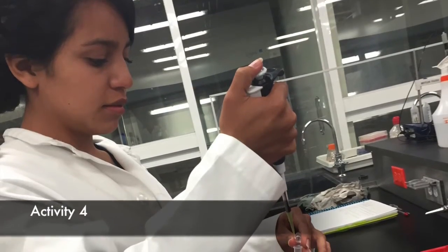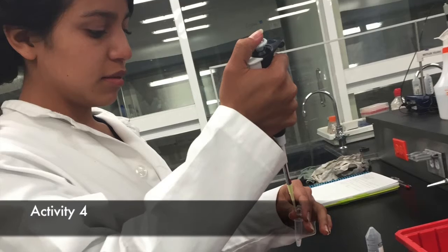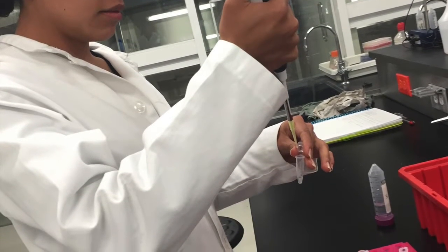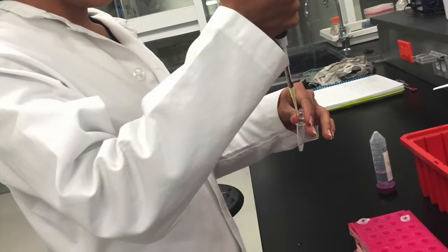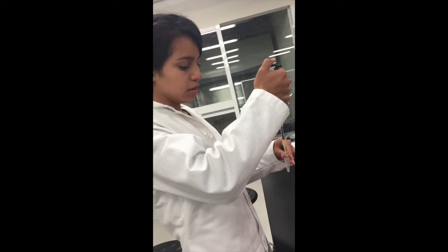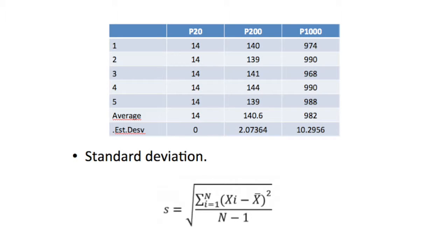To continue practicing the pipetting technique of each member, an activity was performed in which we added an amount of volume in triplicate in a microtube, subsequently recovering the total volume and the recorded performance to verify that the measurements were correct. At the end, the average and standard deviation of the measurements is obtained.